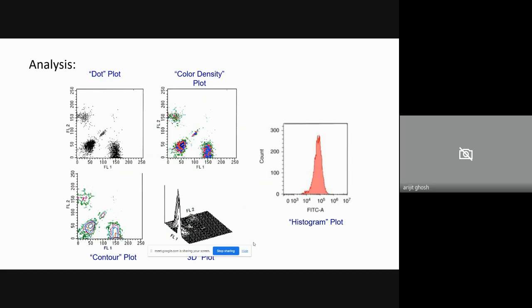And there is the contour plot. A contour plot is basically when a 3D surface is expressed by a series of constant z lines in a 2D format, and they are called contour plots. I am going to discuss the advantages of contour plots.